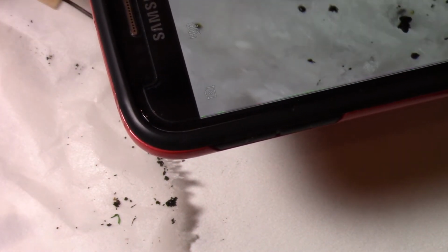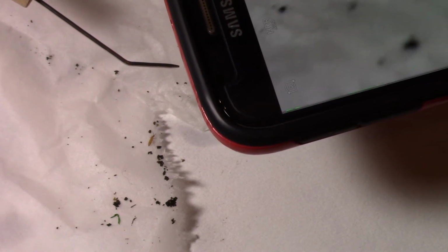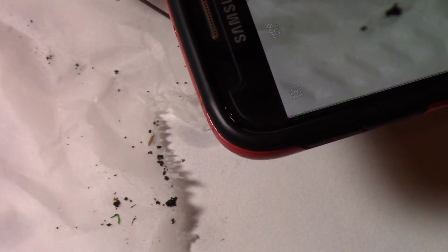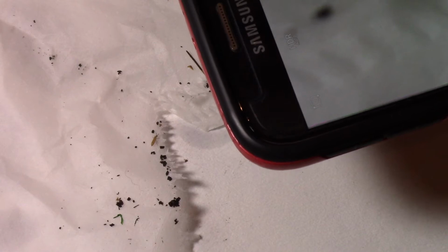What's that? Oh, I don't think that's anything. Oh, I think those might be tiny mites. Like an oribatid mite that this microscope's just not good enough for. Same with that. I think that might be a little mite that I can't see. Yeah, look, that one's got antenna. That's definitely some kind of critter that my microscope just isn't handling. So, again, we're doing the best we can.